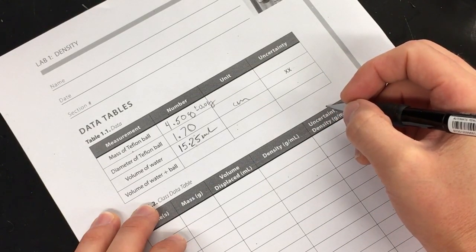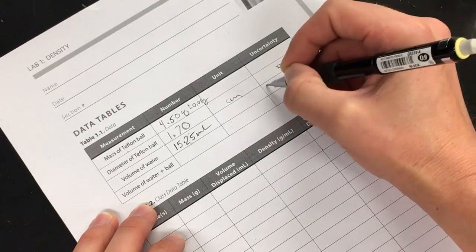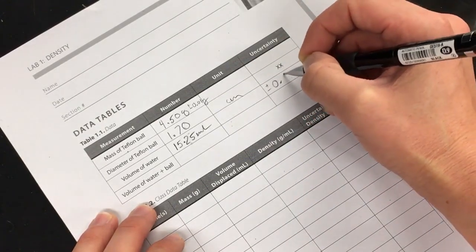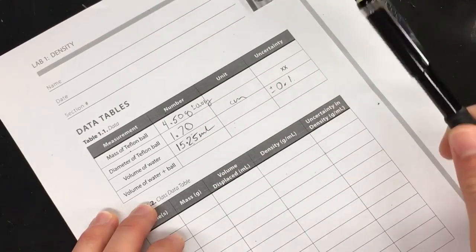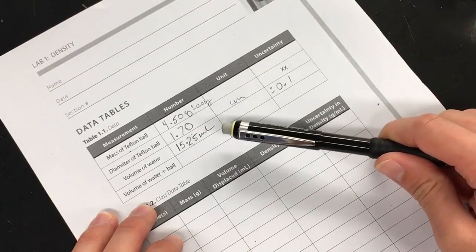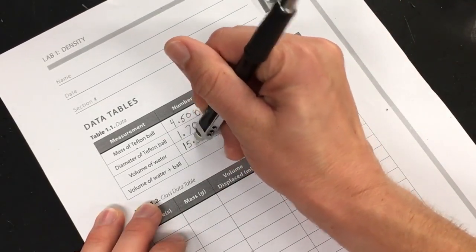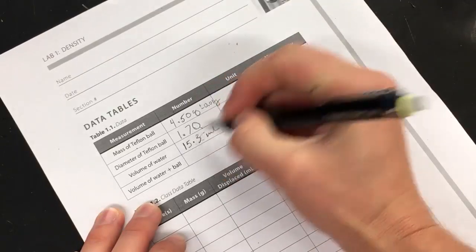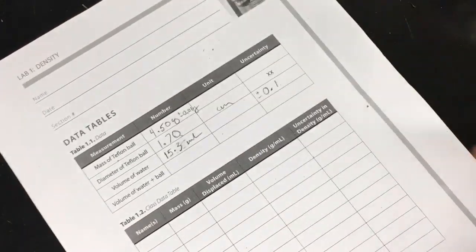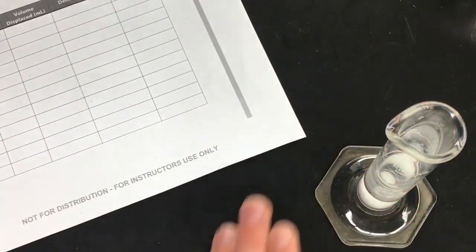And therefore, my uncertainty, I would argue my uncertainty was still plus or minus 0.1. I'm just saying 0.25 because it seemed in between those 2 points. You would maybe round this up to 15.3, right? And still say that uncertainty is plus or minus 1/10. So it has risen now, so I'm going to take that measurement.